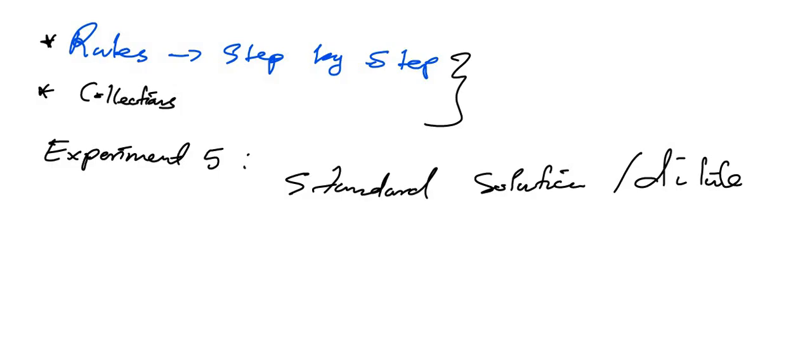But the procedure will still stipulate. Yeah, so part 2 there, they're saying determination of the concentration of ammonia in household ammonia. So they are giving you the instructions. They're saying pipette 5 cubic centimeters of ammonia solution. So you do the pipetting, everything that you do.